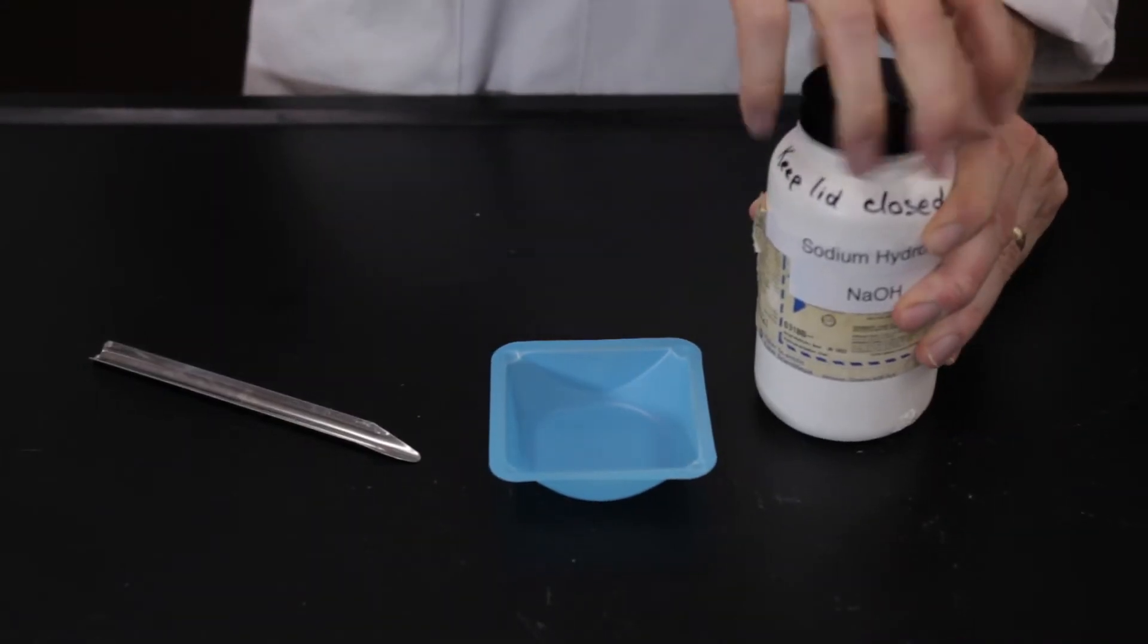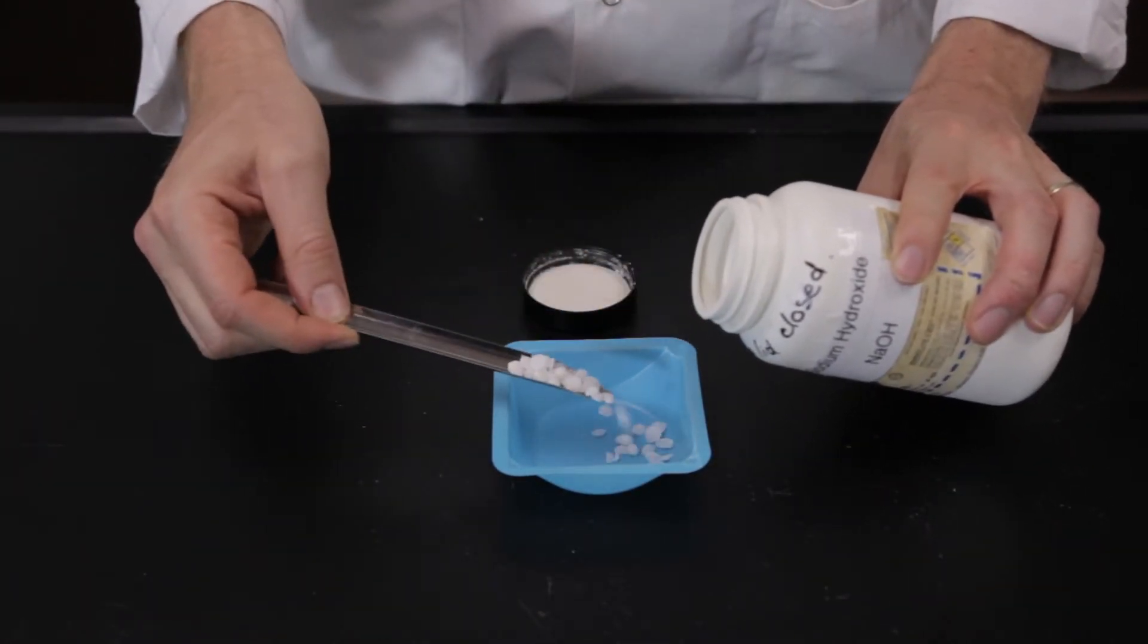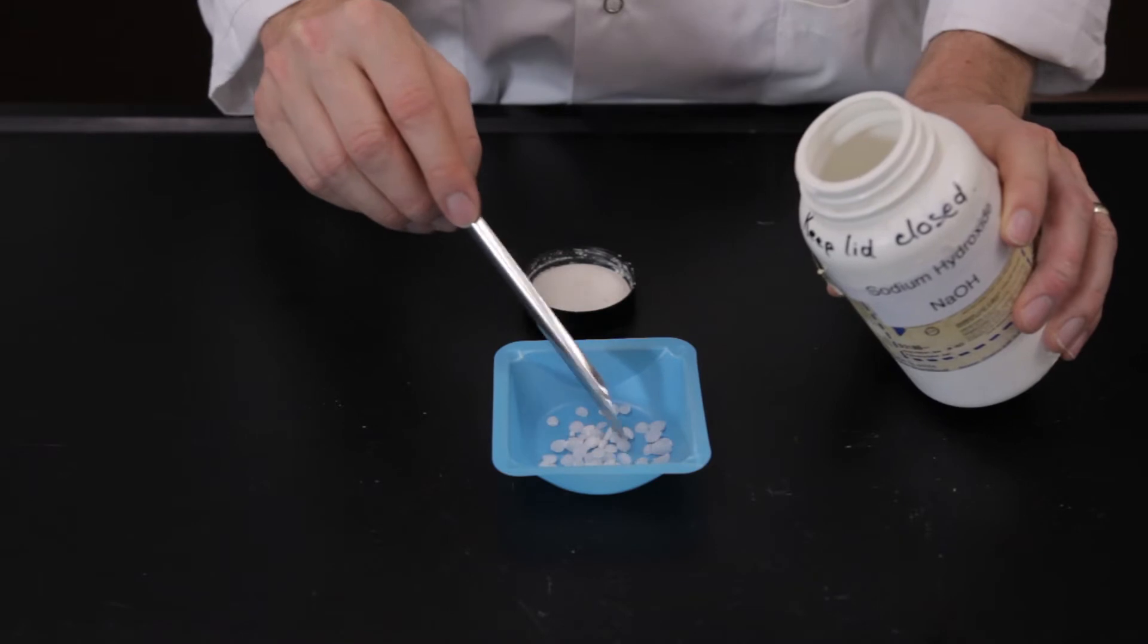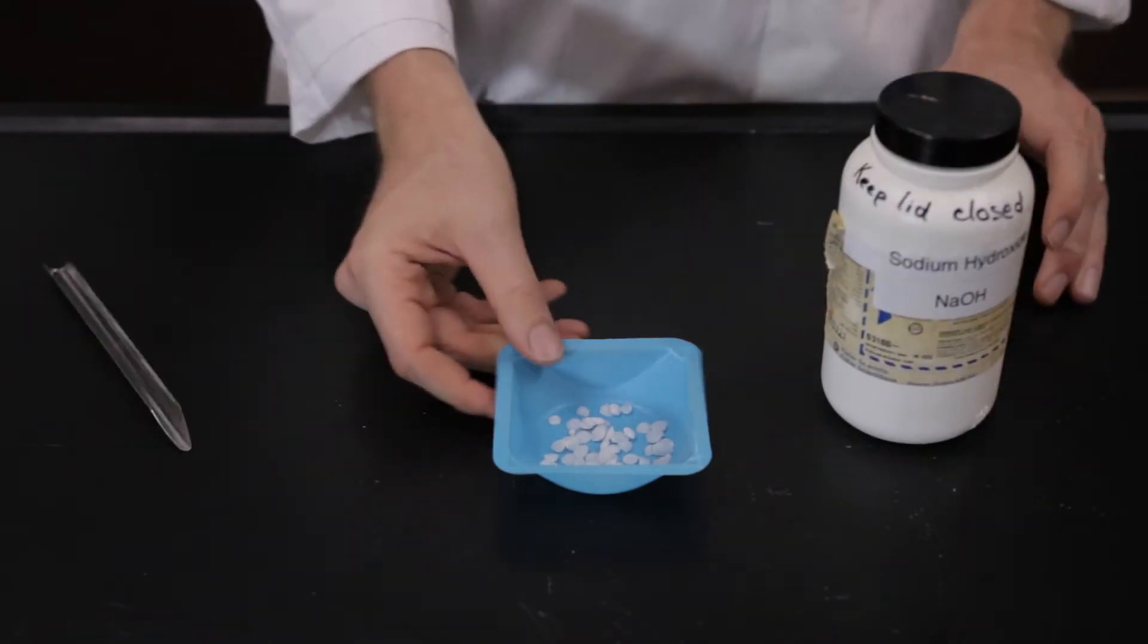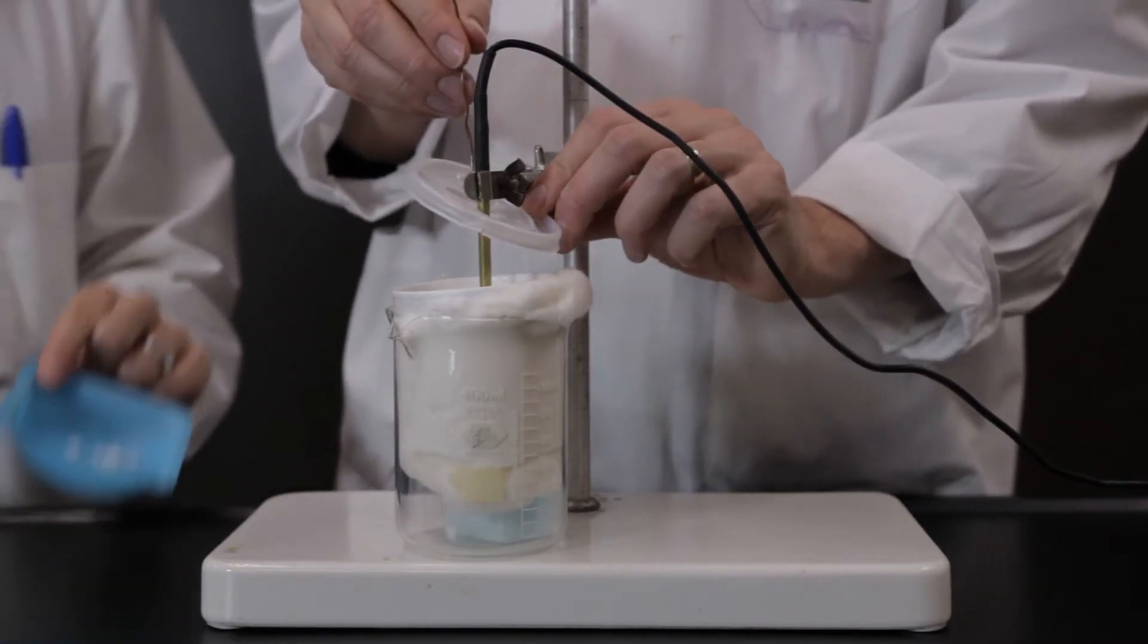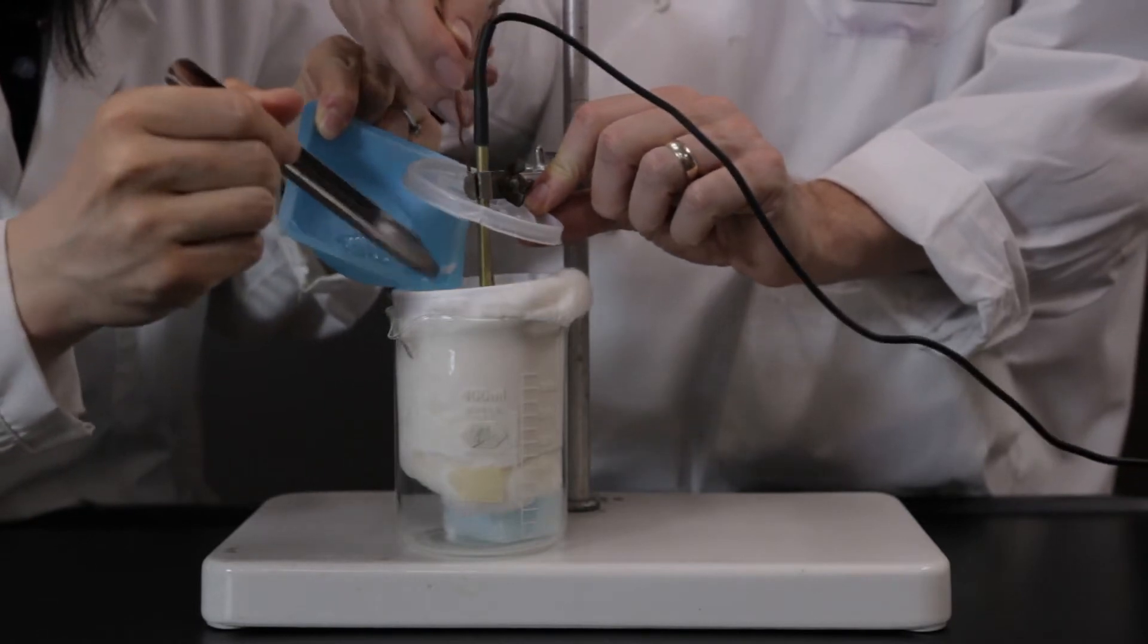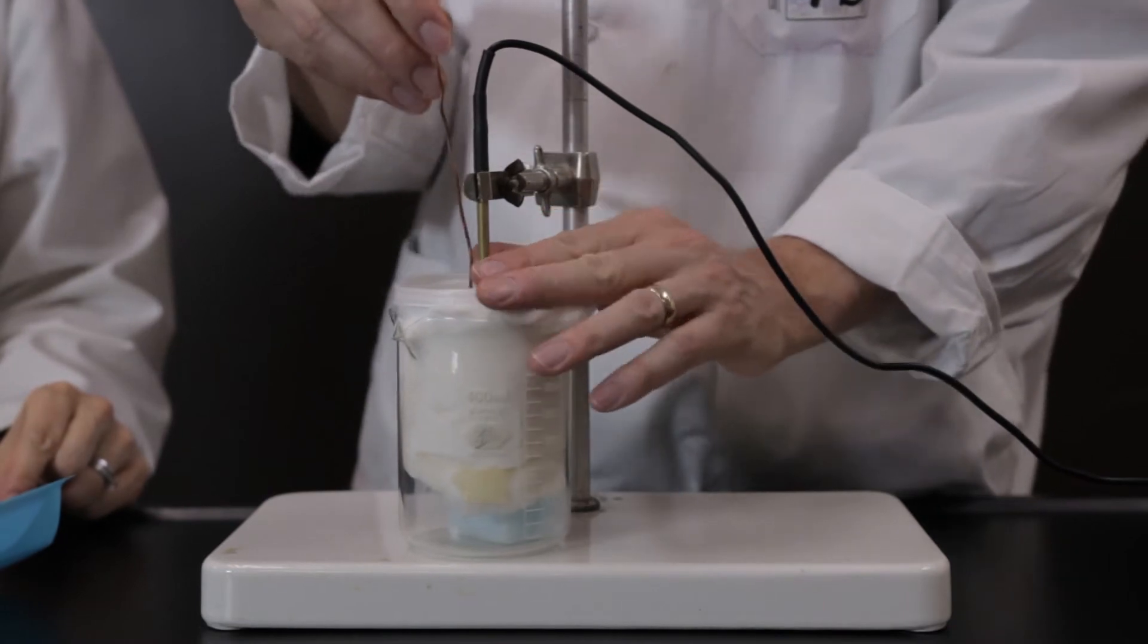Take between 35 and 40 sodium hydroxide pellets with a spatula. Add the pellets of sodium hydroxide quickly to the contents of the calorimeter, cover it, and start stirring. Continue stirring for the entire duration of the experiment.